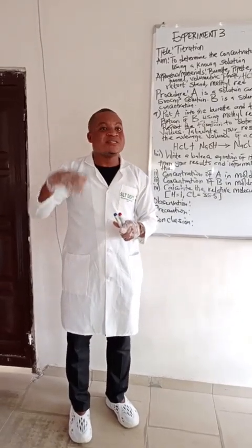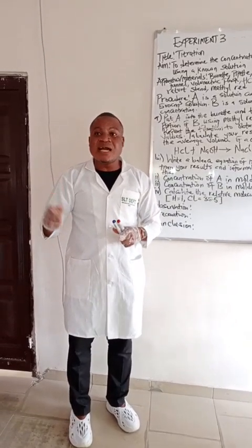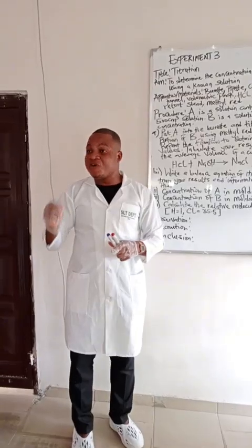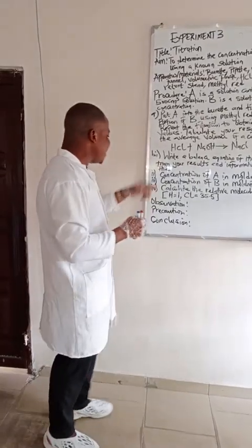This is to avoid splashes. Are you with me? And to avoid burns. That's one of the major precautions you take. Are you following? Yes.